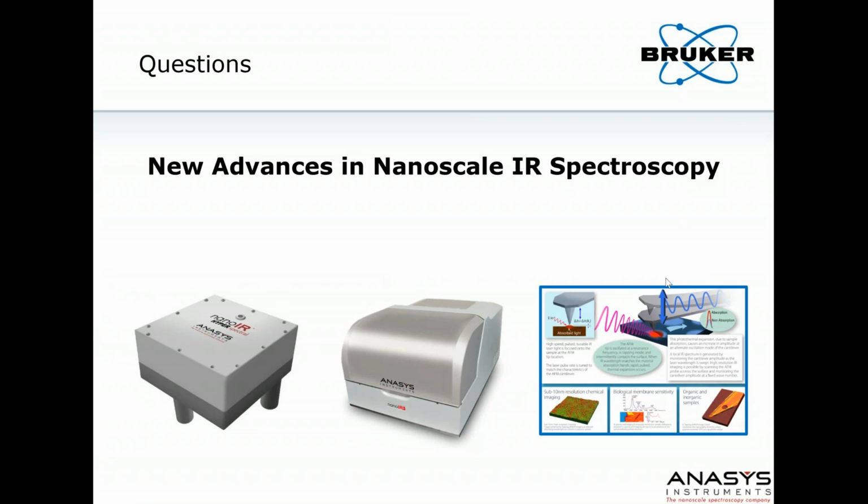And a lot of the contrast we're getting, particularly with tapping AFM-IR, is related to stiffness differences. And those things you can scan a lot more finely. And then you use the spectral information to verify that the two materials are what you think they are. But a lot of the contrast is just because when you move from one type of domain to another, the stiffness changes, and the tapping AFM-IR is very sensitive to that.